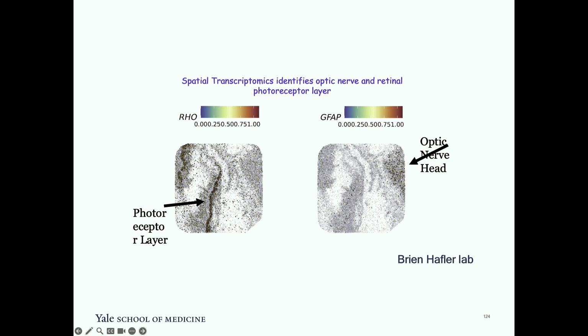They came with a new technique called Curio Trekker, which gives you data at single cell resolution. And at this point, among all sequencing methods, Curio Trekker is the only platform which can give you single cell resolution spatial data. Okay.